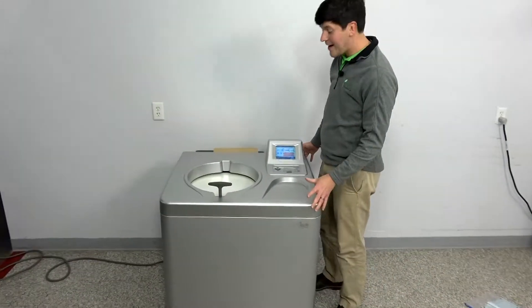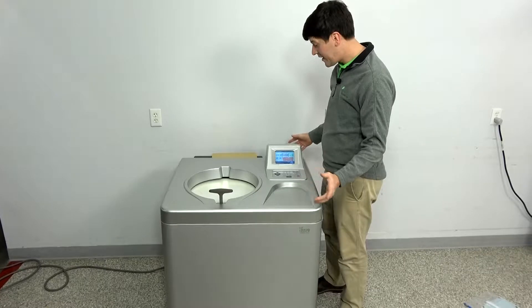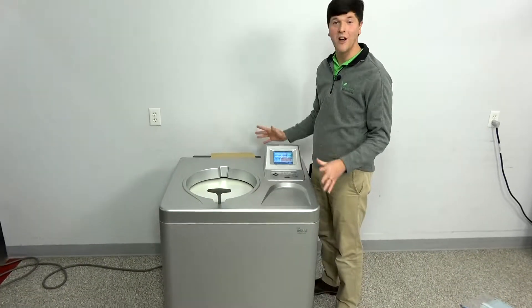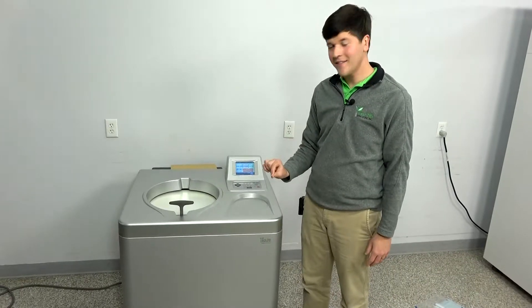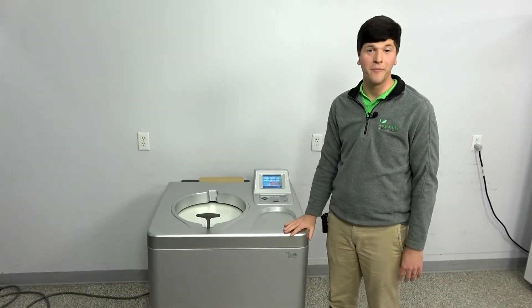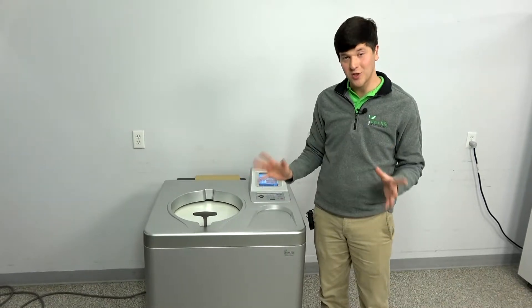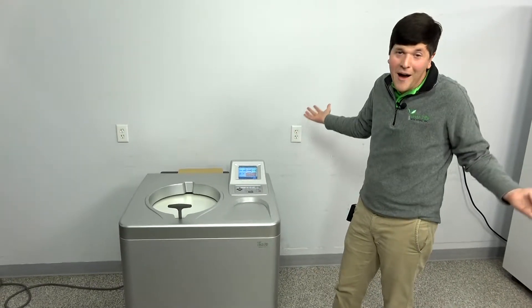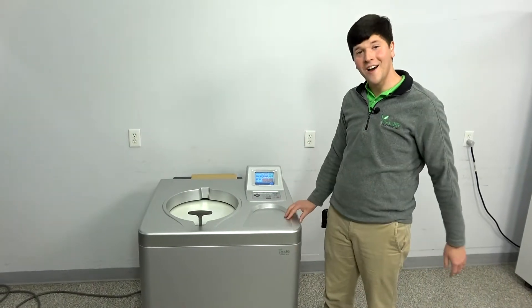All in all, this is a beautiful instrument. It's not every day that you find a used instrument with essentially no use on it. If you're not looking to pay the cost of a brand new centrifuge, this is a great option — you're getting something with an incredibly long lifespan ahead of it. We did give it a quick test spin just to make sure it worked, but not enough to bump that revolution count up from zero. This Sorval WX80 still comes with a 90-day warranty and was tested and inspected by our in-house technicians here at New Life Scientific. Grab it before it's gone.